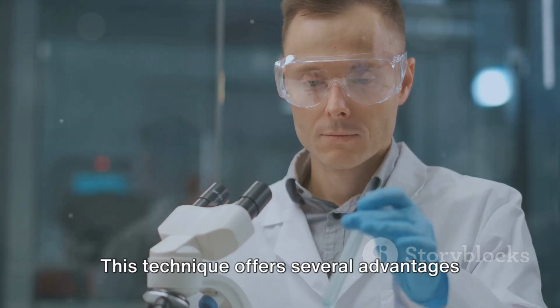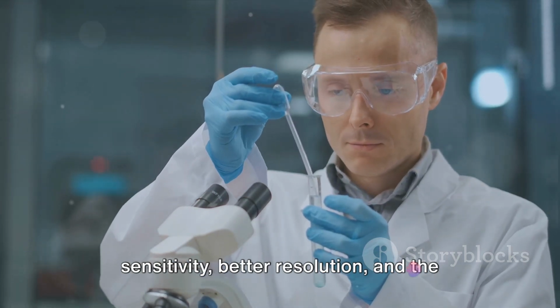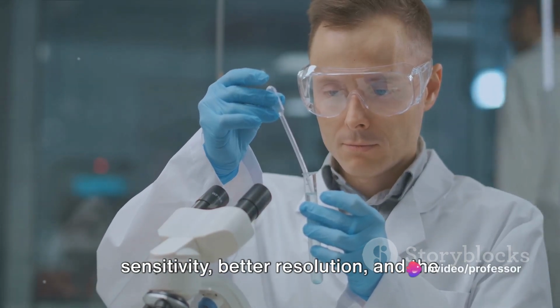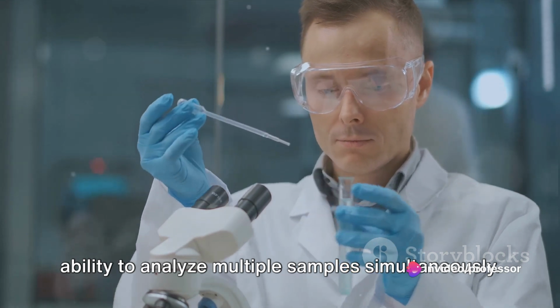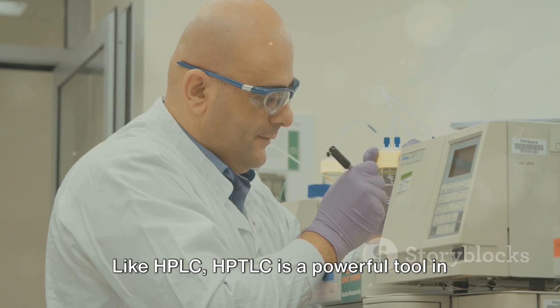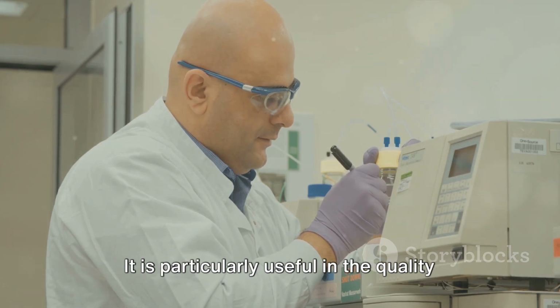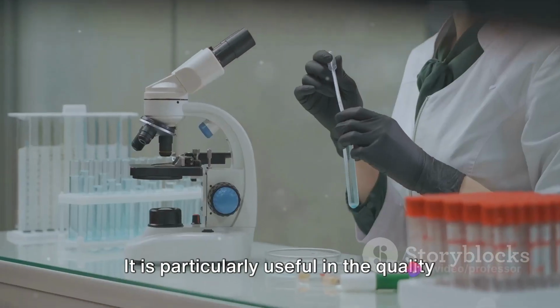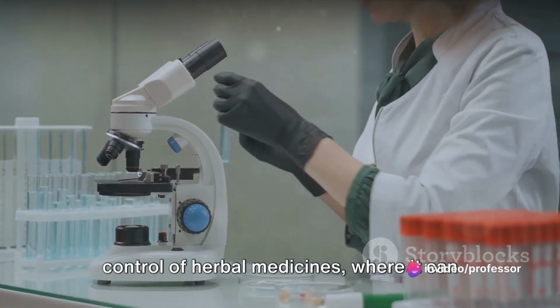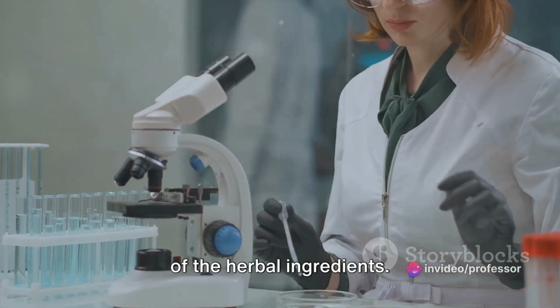This technique offers several advantages over traditional TLC, including greater sensitivity, better resolution, and the ability to analyze multiple samples simultaneously. Like HPLC, HPTLC is a powerful tool in the analysis of plant-derived compounds. It is particularly useful in the quality control of herbal medicines, where it can be used to verify the identity and purity of the herbal ingredients.